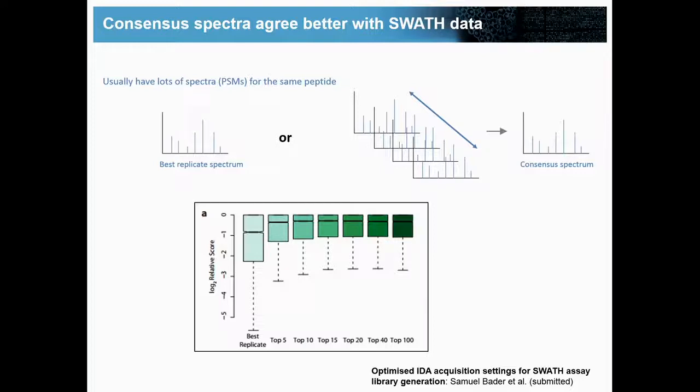So I just wanted to interject quickly that we have since changed the way that Skyline chooses. We still use a best spectrum, so when you look in Skyline, you're actually seeing a physically measured spectrum. But we've changed the way that it's chosen from that, which was the original publication, and we haven't published the new method.